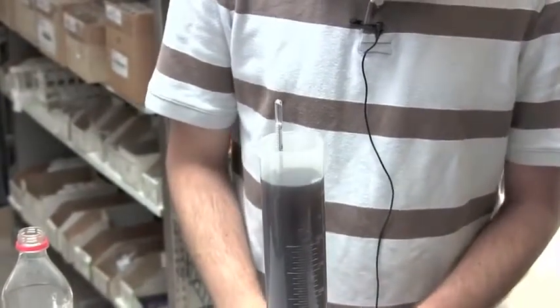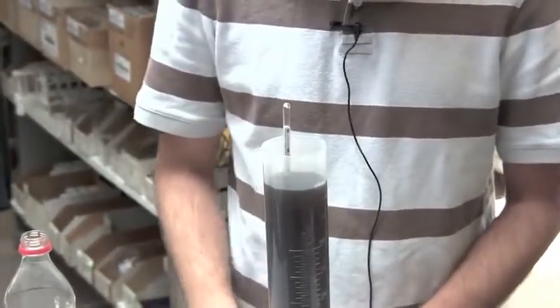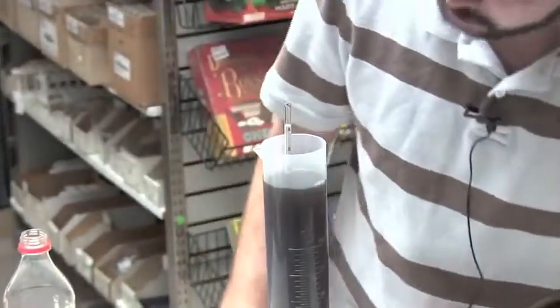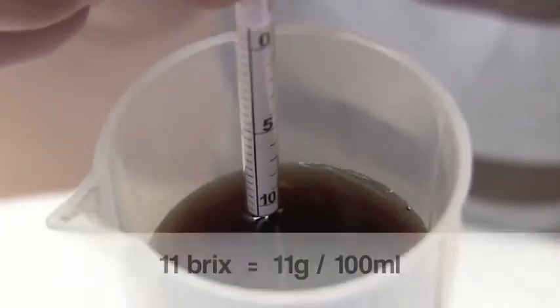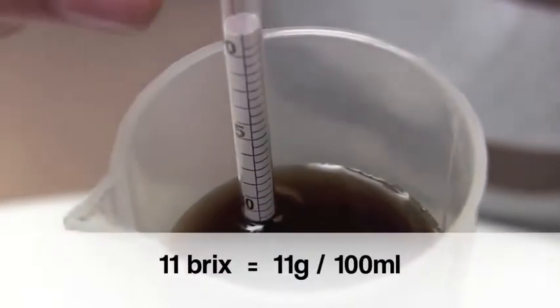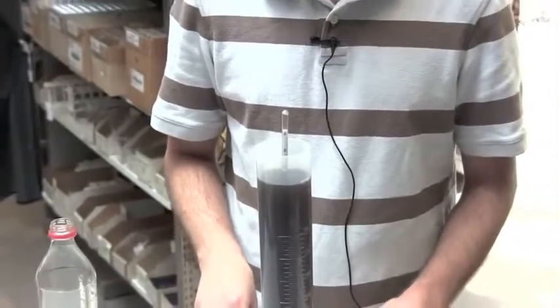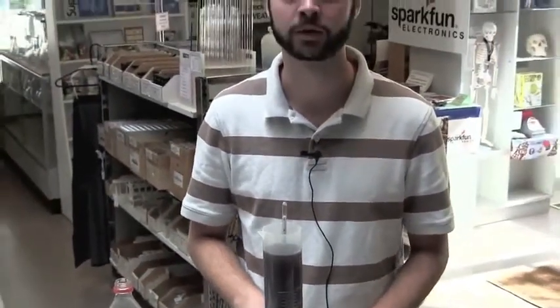Once the hydrometer levels out, take a reading where the surface of the liquid meets the scale on the hydrometer. Looks like in our case it's about 11. 11 is the amount of sugar in grams per 100 milliliters of your beverage. Finally, you can use the following formula to calculate the total amount of sugar in your beverage.